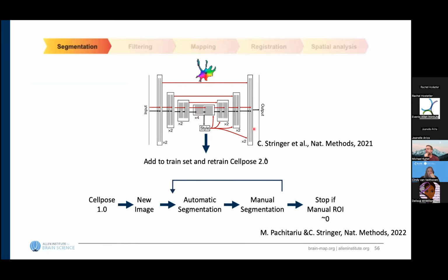On top of that, we now rewrote the code to have a tool that lets us do the CellPose segmentation in 3D instead of 2D. So we don't have the same kind of cylindrical cell shape anymore than we had before.